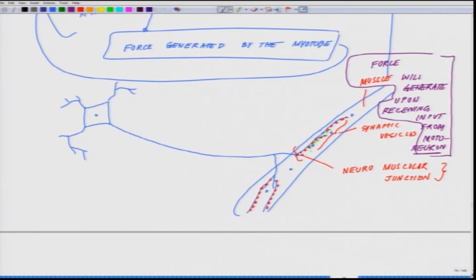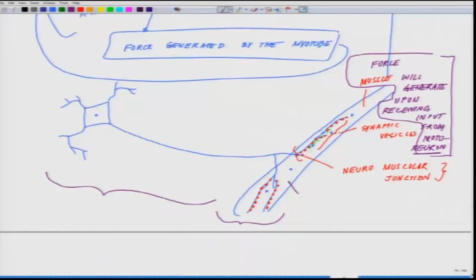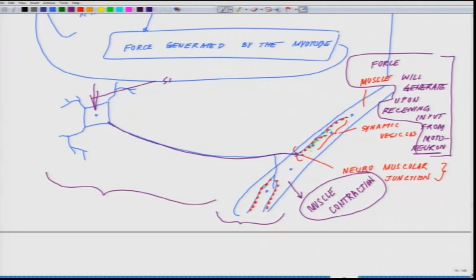now we are opening a little bit more complexity where you needed to have two different cell types in a culture dish or integrate it on top of a micro cantilever. I will come to that. So, now we know how we can measure the muscle contraction, but what we do not know is if this muscle is not spontaneously contracting, how we can integrate it with a neuron which will make this muscle contract by sending signal in the form of action potential. Or you can even, I put this electrode here to tell you, you can even stimulate the motor neuron.